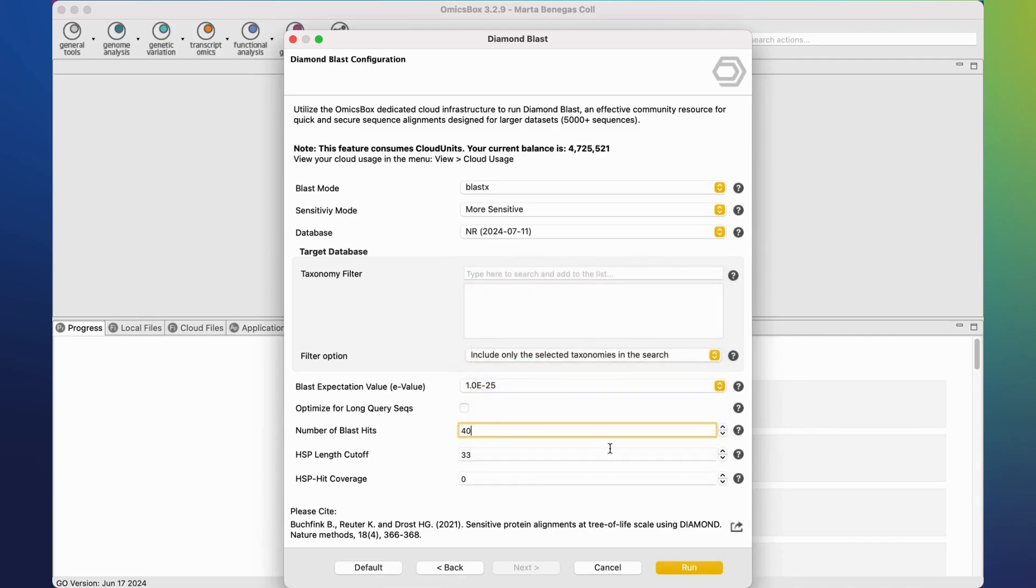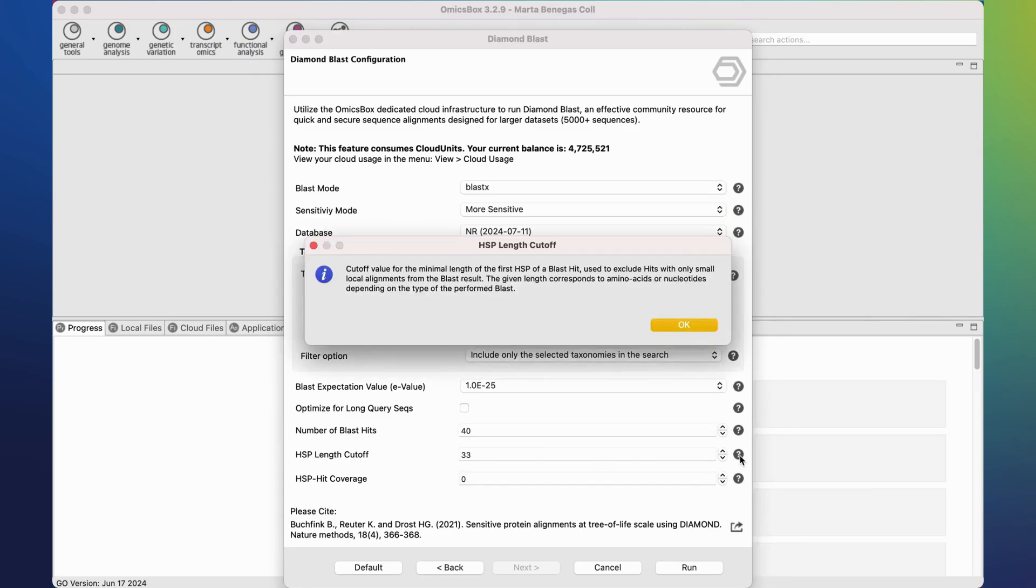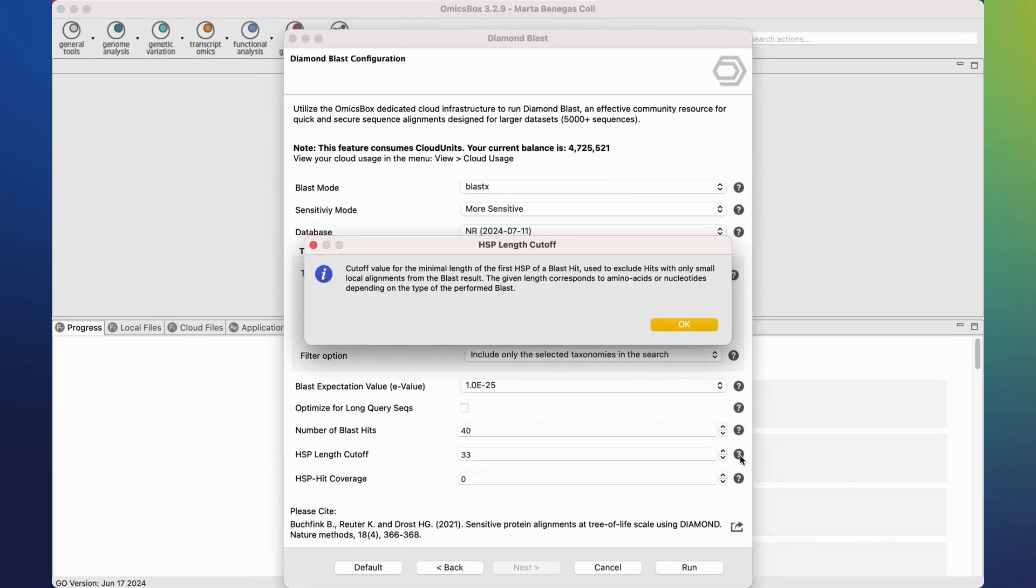If we don't know what a parameter is, we can click on the question mark button to obtain a brief description of it.